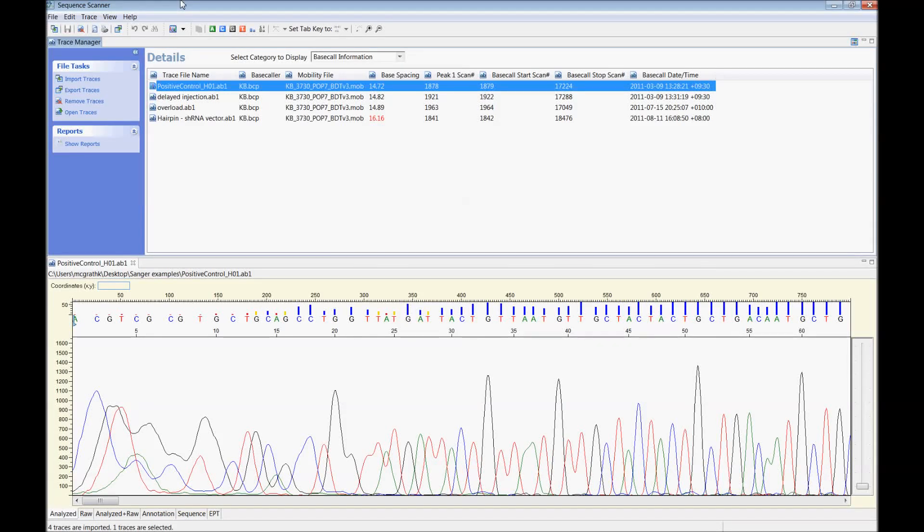Hi, my name is Ken McGrath from the AGRF and the purpose of this clip is to run you through some examples of common problems with Sanger sequencing and what you can do to get a better result.